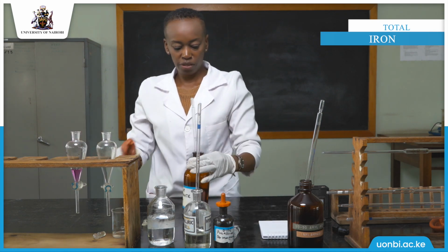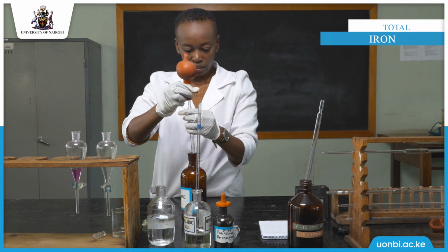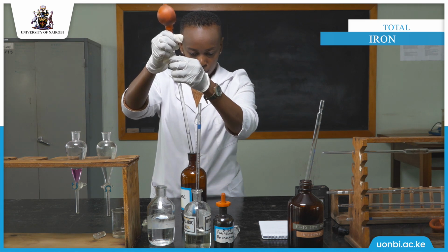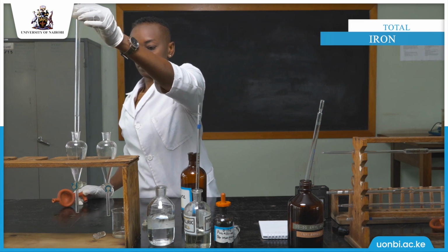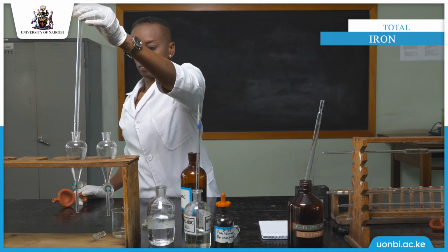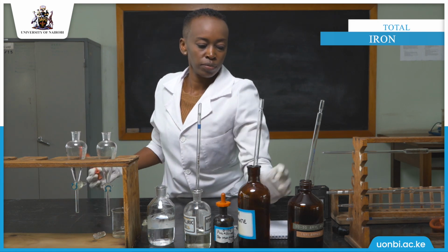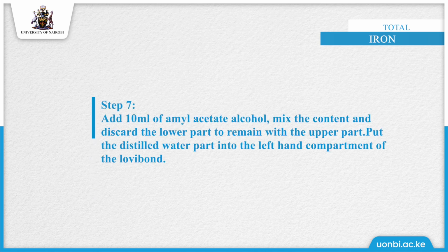Then we add 5 ml of ammonium thiocyanate, and then 10 ml of amyl alcohol acetate.